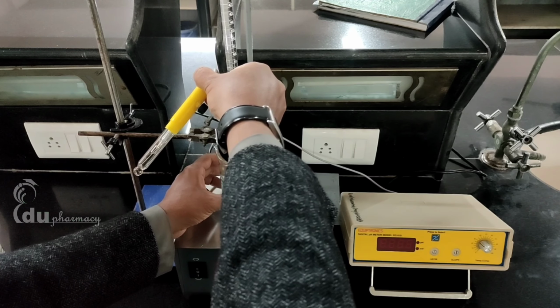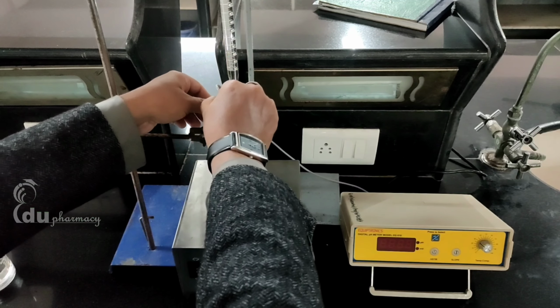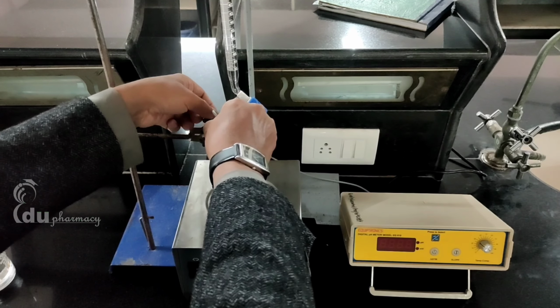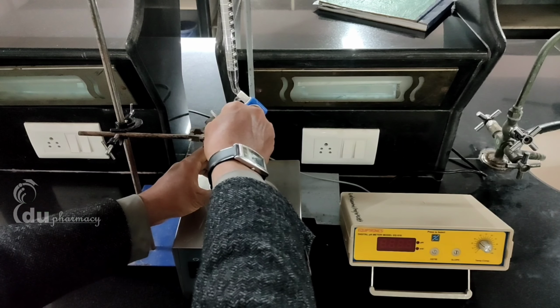The pH readings have to be taken in the same way as we have done for the glycine solution to get a titration curve of the copper glycine complex.